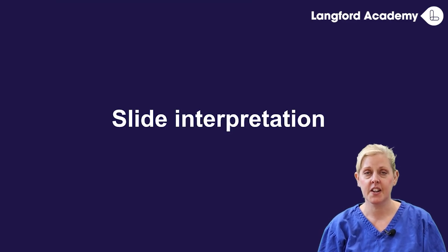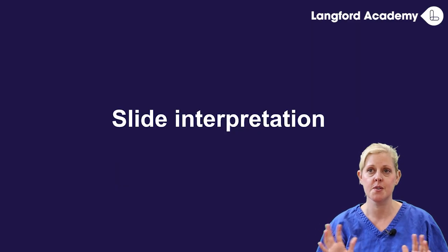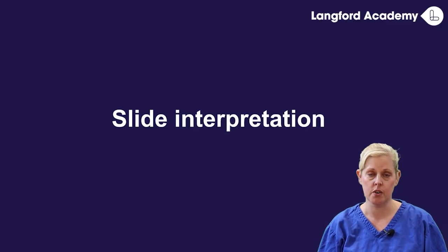Hi and welcome back. This is section 3, so this is the last section I'll be talking to you about, and this is interpreting those slides that we have just gained via sellotape, impression smears and ear cytology. This is usually the part where everyone says, oh my god, it's too hard. It's really not. It really isn't.